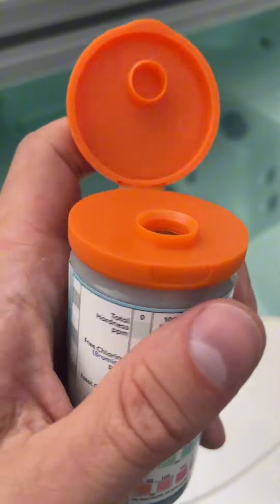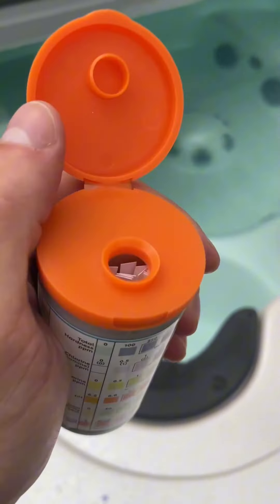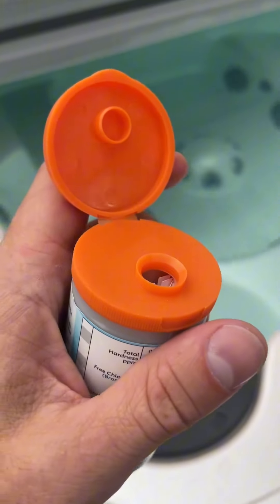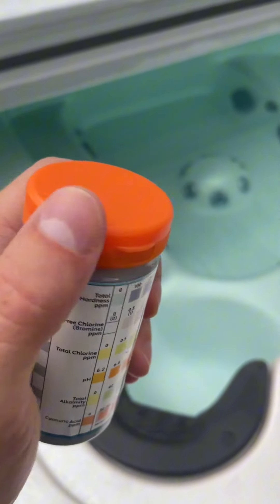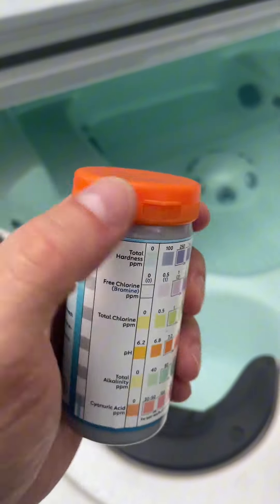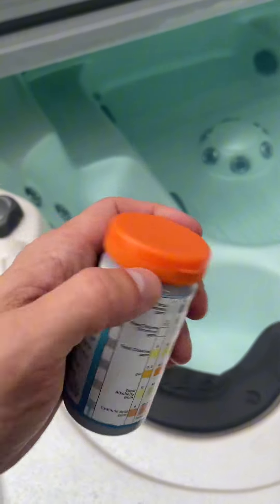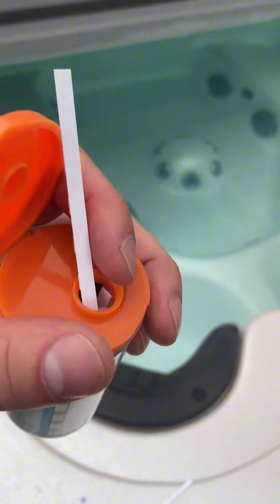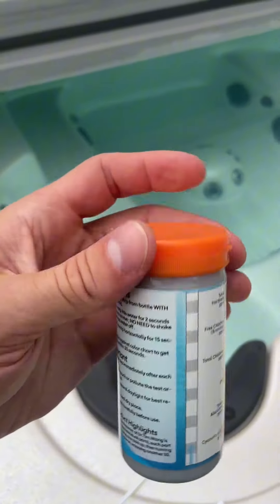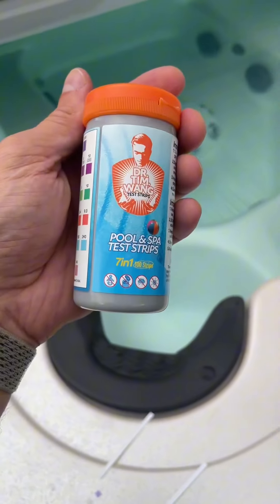The last thing I want to mention is this cap — make sure it has a very nice seal. That's important because these strips react with moisture, and if you're in a really moist area, having a solid lid that closes very well is critical to keep moisture out. When you pop it and dump out a strip, make sure you close it right back up so that next time you use it the strips are ready to go and you get accurate readings. Hope you guys like it!